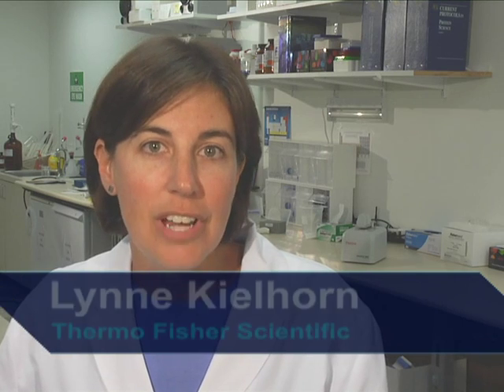Hi, I'm Lynn Keelhorn at the NanoDrop laboratories of Thermo Fisher Scientific. Today we will show a procedure for determining protein concentration using an innovative microvolume spectrophotometer, the NanoDrop 2000C.